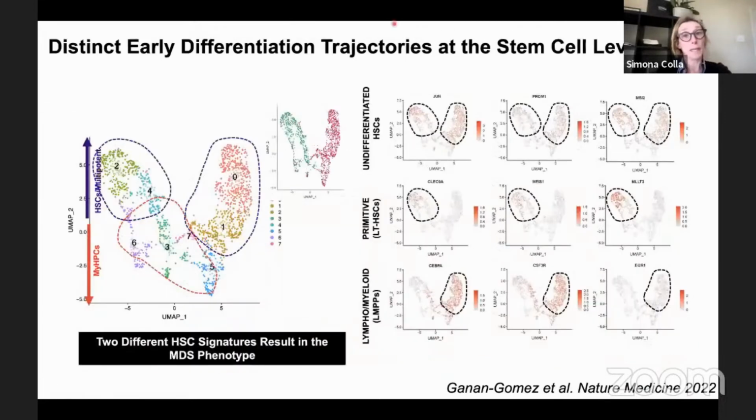Because, of course, as I said before, we had to validate our result using single cell technologies. Because, as I said before, flow cytometry is good, but this result now, at the level of the hematopoiesis, needs to be validated by analyzing the transcriptional differentiation state of the cell.